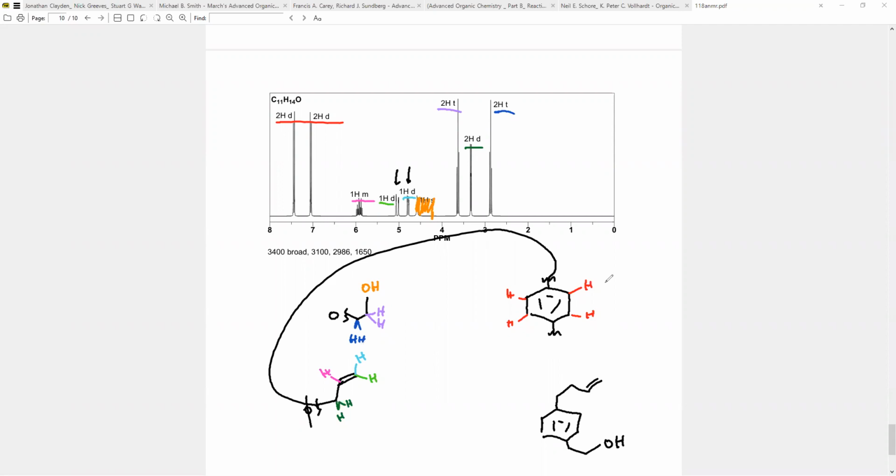That's the complex ones. These are like 118B level, but you can see that even a 118A student can answer them. You just have to use your brain a little bit. All right. So again, what I really want you to take away from this is how do we rationalize the aromatic splitting, right? Don't memorize all that stuff. It's ridiculous. What you should know is, if I have a benzene ring and I know how many hydrogens are around it, how can I rationalize what the structure is, right?